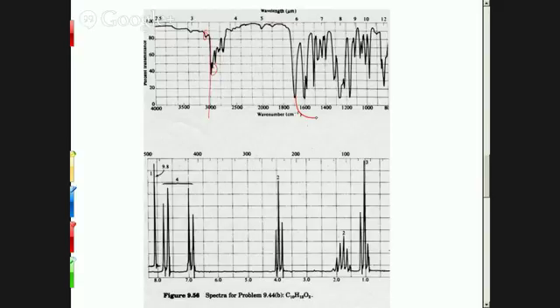You remember? You will have those correlation tables on the exam. Yeah, it can be any kind of carbon double bond oxygen. So carbon double bond oxygens always come up between, let's say, 1,600 and 1,800. It's really the only thing that's in that area. So then between this and some of these other peaks over here, we'll say a benzene ring with a question mark. Maybe? A good guess for now? We'll see if we can confirm that. So just to recap here, this tells us that we have sp3 carbon hydrogen and sp2 carbon hydrogen going on here.